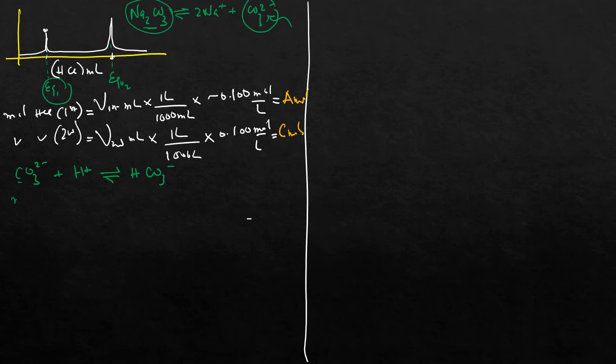Hence, moles of my carbonate will be what? A moles. Remember, at the first equivalent point, we are converting this to that.